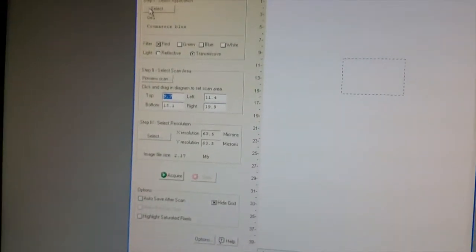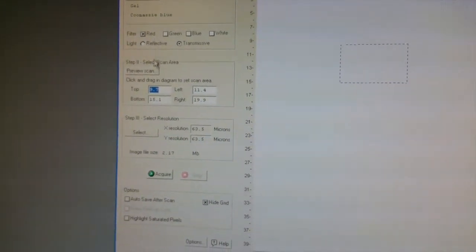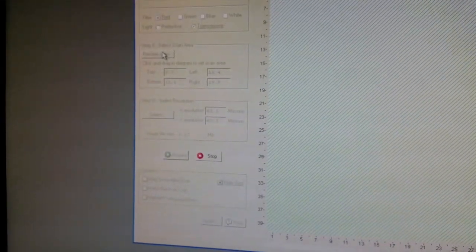We come to this interface. For the gel, it's already pre-selected as gel — mostly blue here, but we're going to use red. What you do here is start with Preview Scan. It will scan the whole glass plate one time, so you'll see the gel in the middle and the rest will be empty.